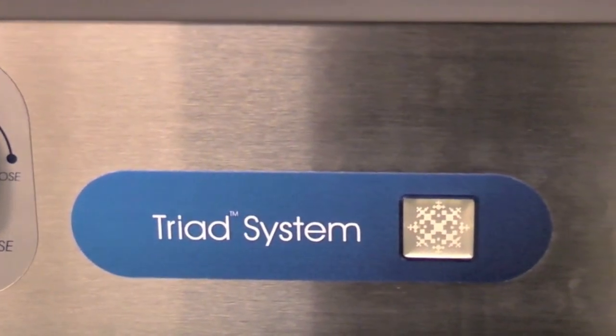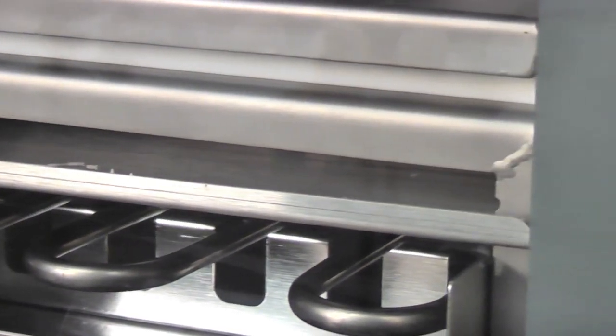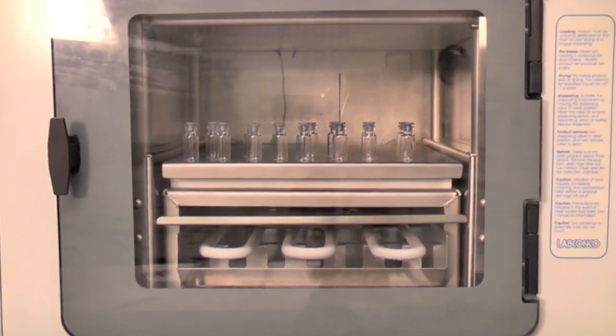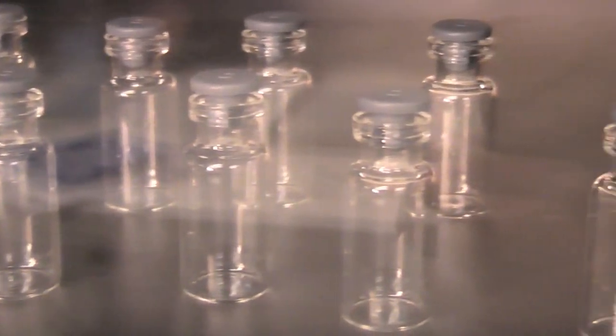LabConco's Triad freeze-dry system is an all-in-one freeze dryer that allows pre-freezing, primary drying, and secondary drying in one unit. This video will show you how to program the Triad in automatic mode.